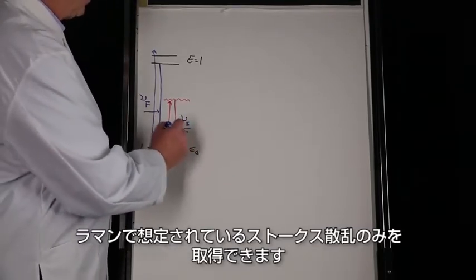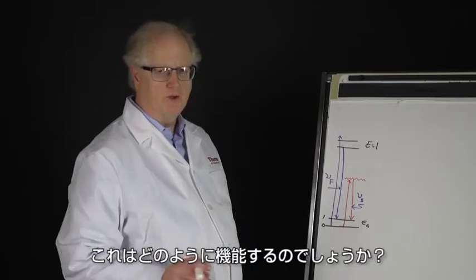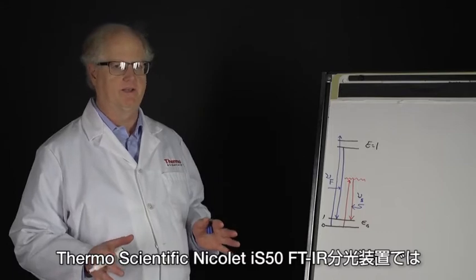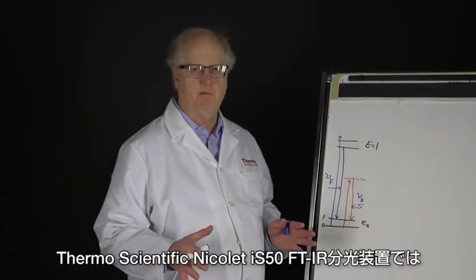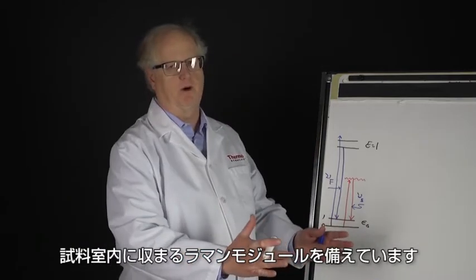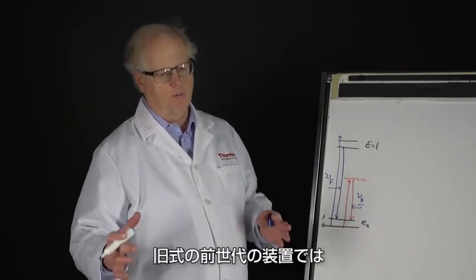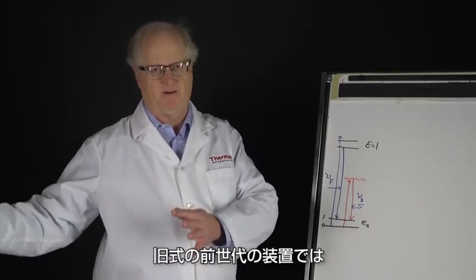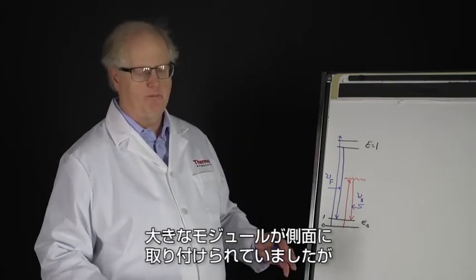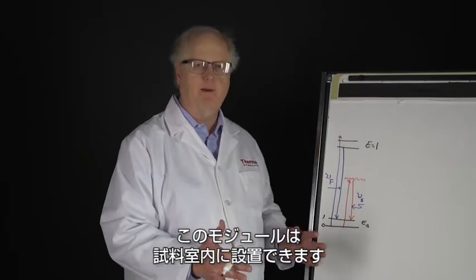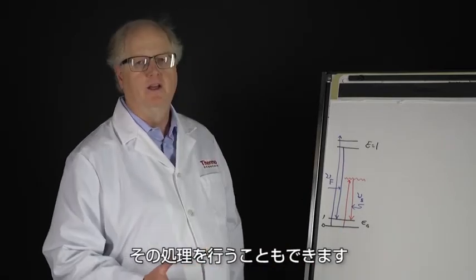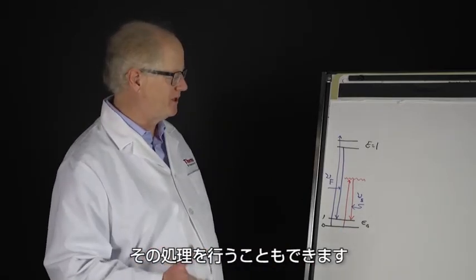On the ThermoScientific Nicolet iS50 FTIR spectrometer, we have a Raman module that fits right into the sample compartment. It doesn't require sitting on the side like previous generation instruments had. This module just fits right in the sample compartment and utilizes the interferometer and detector scheme of the Nicolet iS50 spectrometer.